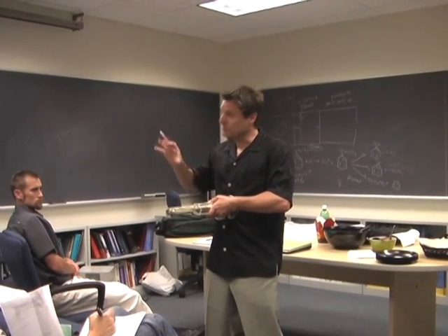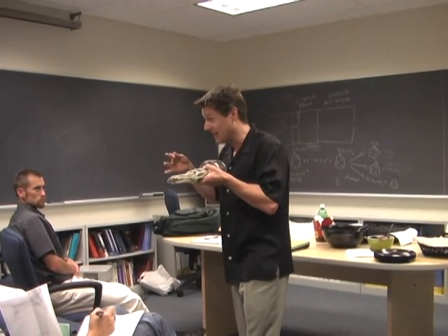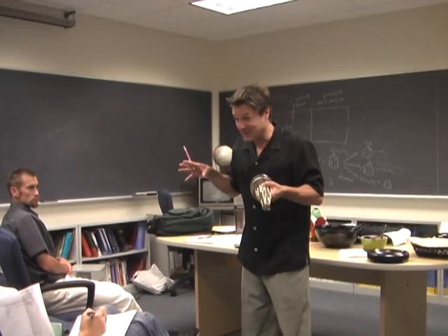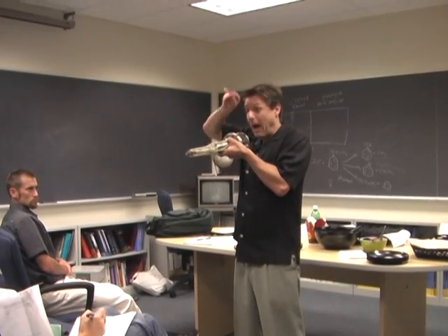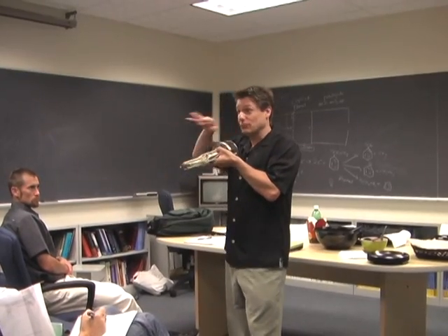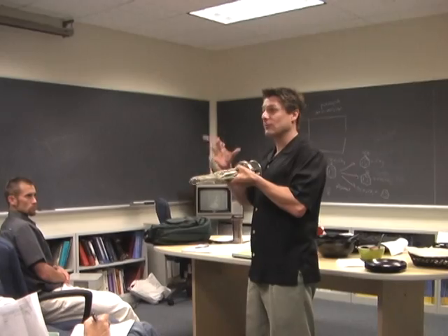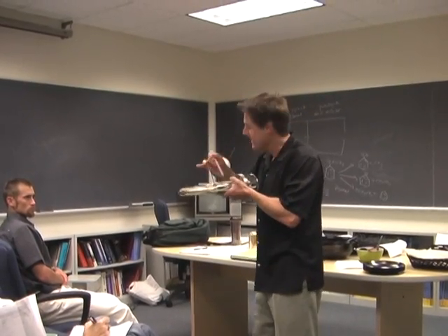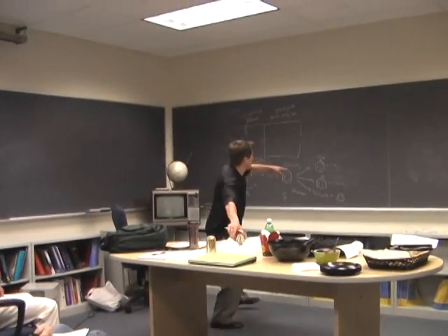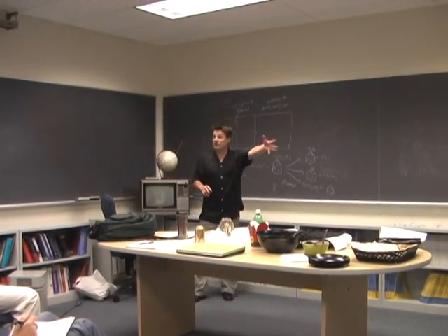It's kind of hard to explain what happens when you've got these ion fragments coming through in 3 dimensions. So my little pea brain has to break it down into its individual pieces. I'm going to look at the 2 positive rods first and how that affects ion motion, and then we'll look at the 2 negative rods. Then we'll put those 2 pieces back together and see how this measures individual ion fragments coming through one at a time, right? We can't have them all coming through at the same time.